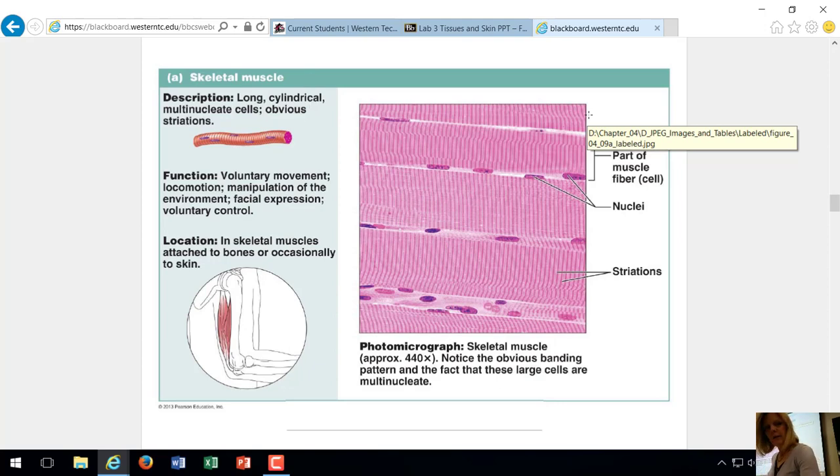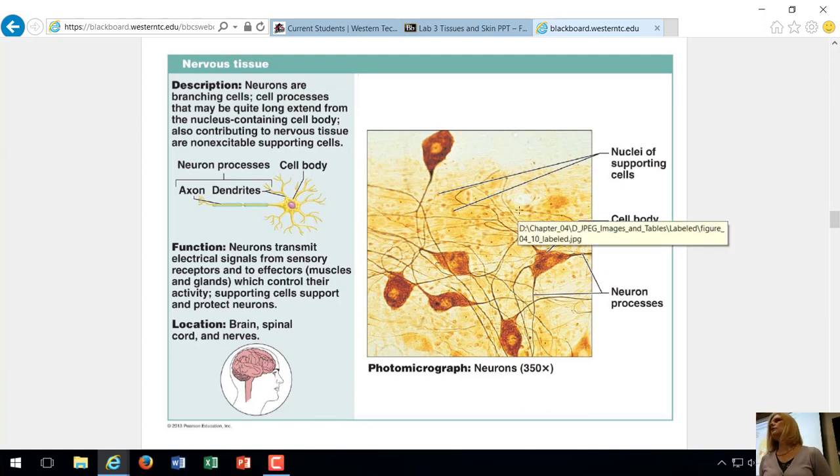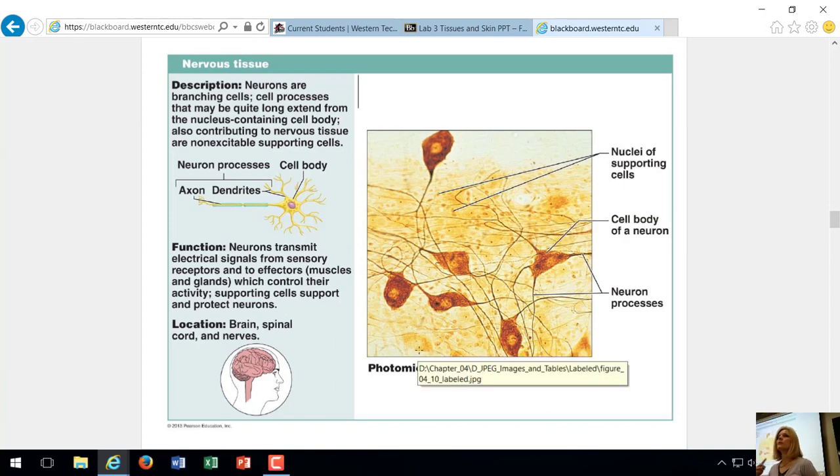That's on page 137. And then page 139 is nervous tissue. This is a very unique tissue in the sense we have these nerve fibers. See the large cells with the nuclei and then the long fibers coming off. See that long fiber? And then the large nucleus? Those are nerve cells that are supported by these little tiny dark dots in the background. We'll give some description to those in lecture. But for right now, just know the whole tissue as nervous tissue. And where do we find nervous tissue? Brain, spinal cord. That's where we find nervous tissue. Those nerve cells are called neurons. But you don't have to know any of the detail within these tissues. Just look at the tissue and be able to name it. So it's nervous tissue and the classification is nervous tissue.